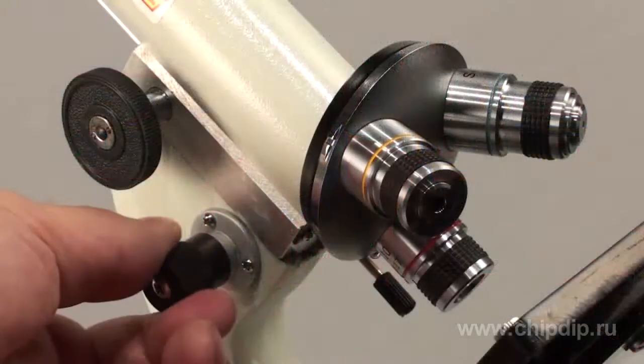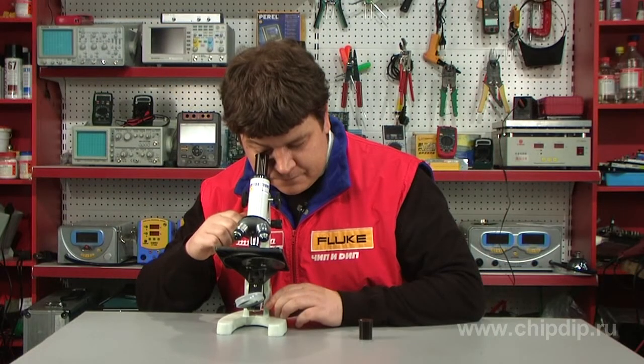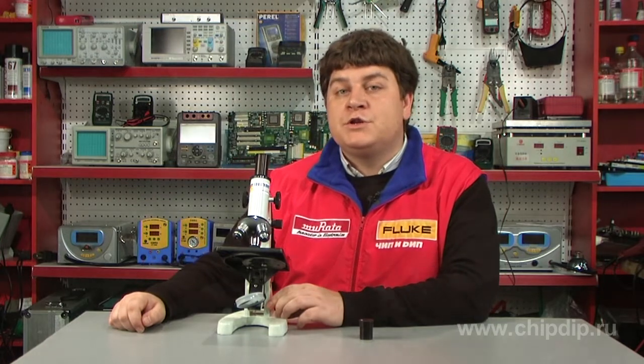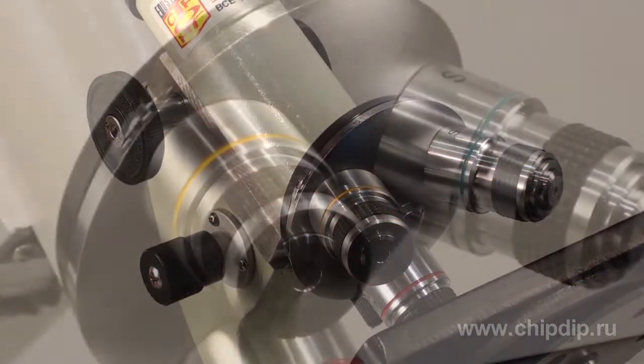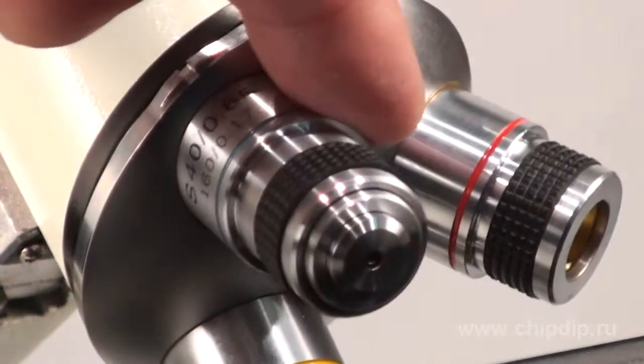Here is a sharp image. We recommend using 1:40 or 1:64 zooming first, just to find the required fragment. Then you can use other lenses to get a more detailed view.